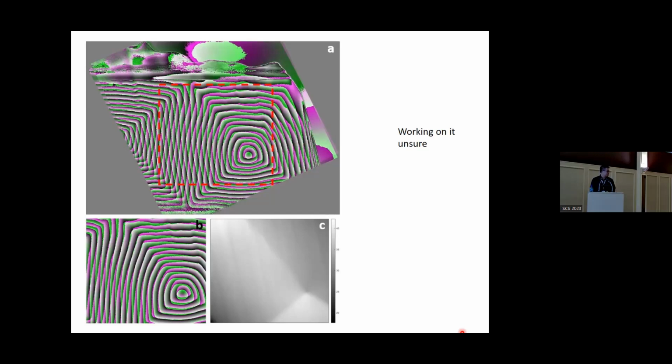Thank you for the talk. When we talk about traditional ptychography, the quality of the final phase images depends on the overlapping ratio of the probe in the case of a defocused probe, right? So when we switch from there to near field ptychography, could you comment on the dependency of the quality of the phase image on the overlapping ratio? Do we gain any benefit when we switch to near field ptychography or not?